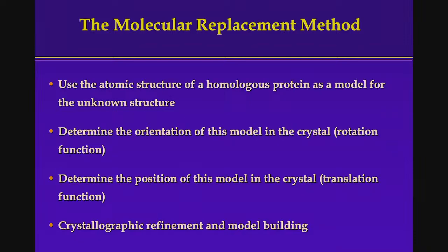But then there's AlphaFold now. So essentially, almost anything you want to work on, you have a model now from AlphaFold or Rosetta Fold. And that model oftentimes is sufficient to determine the structure by molecular replacement. So that will give you a starting point to give you the phase information and determine your structure. So that's why now, even in my lab, when we have something new, we just go to AlphaFold or Rosetta Fold, get the model, and use that as a starting point. And most times it succeeds getting the structure.